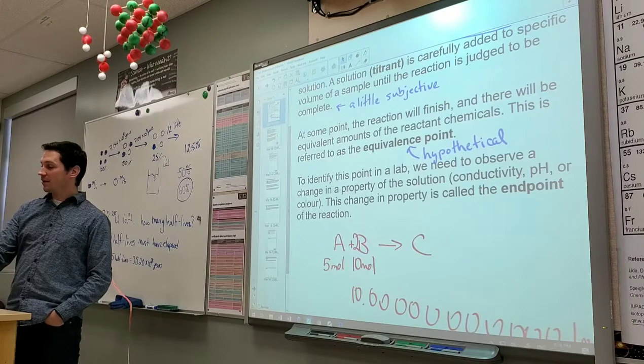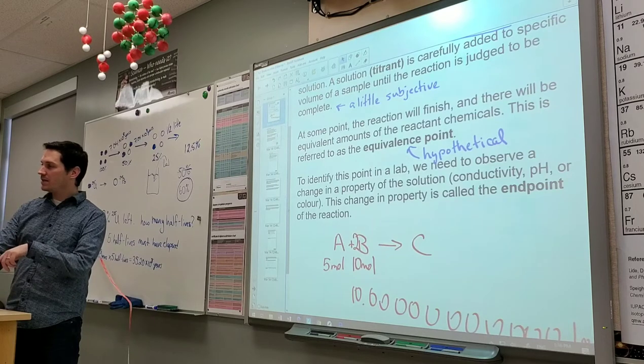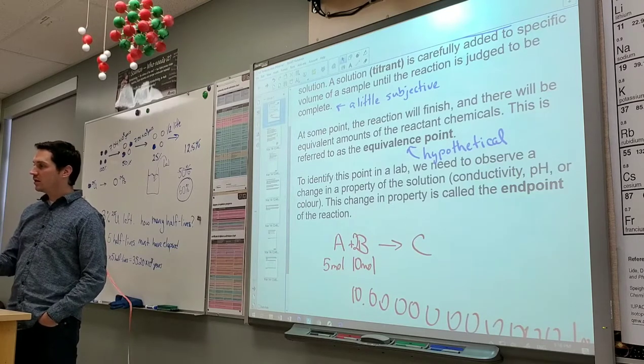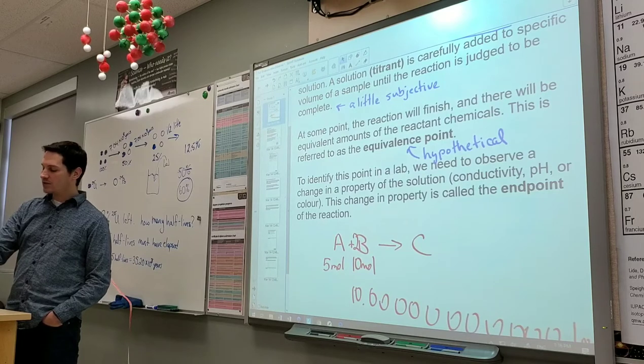And you would shake it, right? You're trying to mix up your sample, and you would shake it. If you know the rate that this solution is adding at, I don't know if you can see the drops adding, then you can stick a pH probe in there and constantly measure the pH.